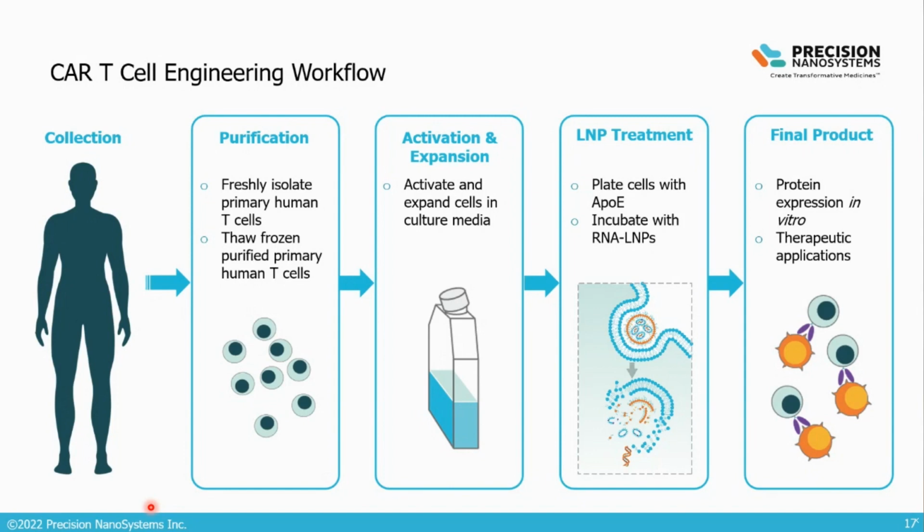We have the CAR T cells, either that can be checked for protein expression, which is what we do using flow cytometry, or taken further for therapeutic applications. And really stay tuned, because in the last data set, we will do a co-culture assay with our CAR T cells, either with and without gene editing, to look at the therapeutic potential of the resulting CAR T cells.